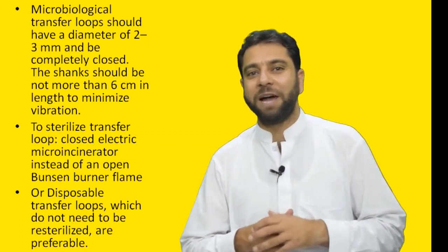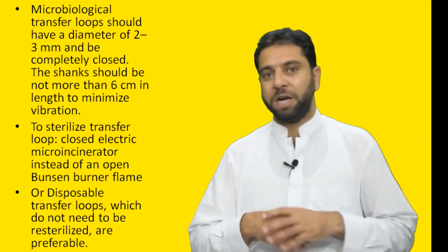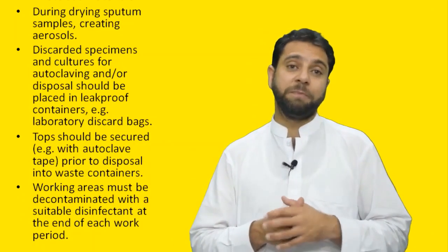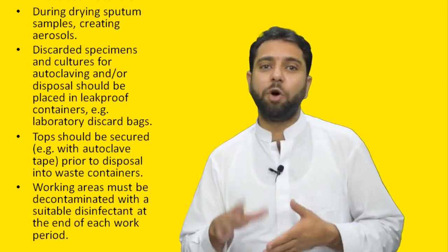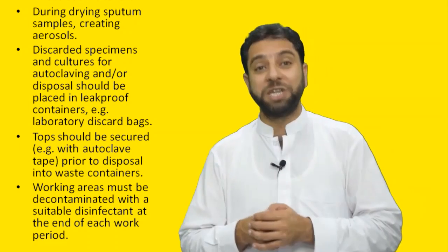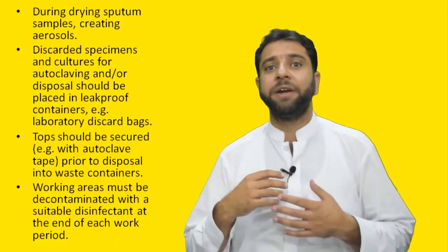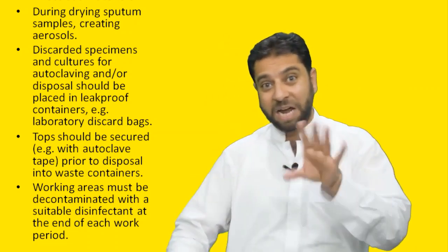a closed electric micro incinerator should be used instead of an open flame. Disposable transfer loops are preferable, which do not need re-sterilization. Similarly, if remaining sputum samples are left open, they create aerosols during drying and disperse infectious materials. Therefore, discarded specimens and cultures should be placed first in leak-proof containers with secured tops.